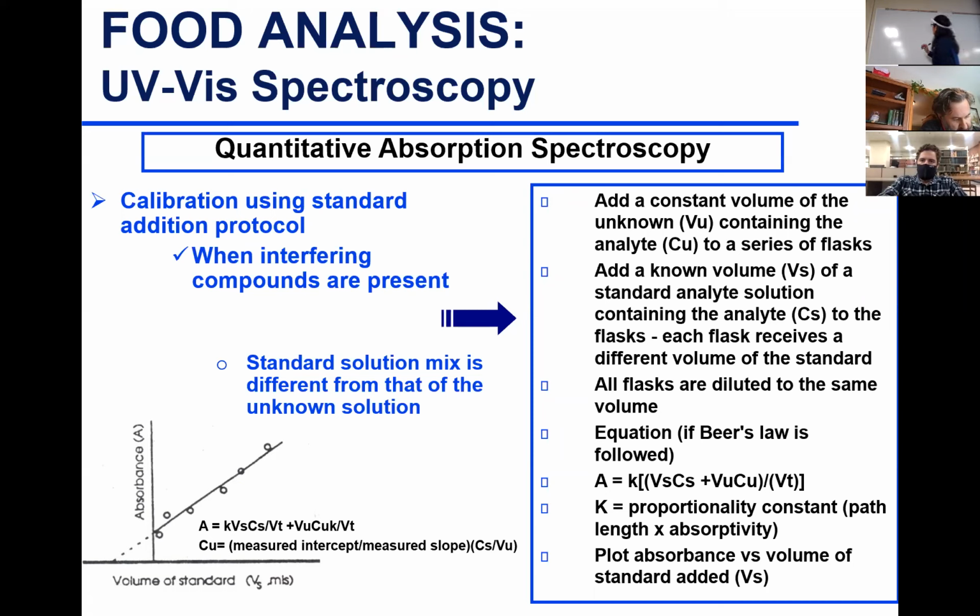Okay, so what you have, usually you build a standard with four to five concentrations of your standards. So let's say I'm going to build my standard curve with five standards, different concentrations. So I have my standard stock solution. So I prepared a standard stock solution, let's say 100 ppm. And then I get five volumetric flasks that I'm going to prepare my standards in the sample matrix.